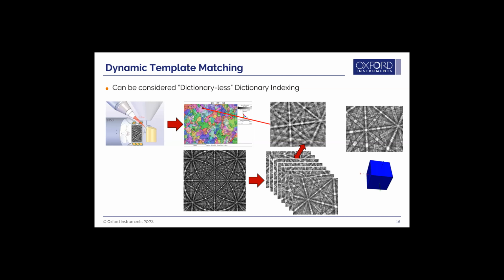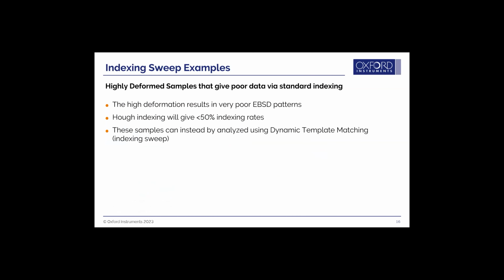So you can imagine that if you're generating this many patterns, it could take some time to actually focus in on a solution here. The good news is it actually will come up with a solution every time. The bad news is it will come up with a solution every single time. And so I'll give you an example first, and then we'll go through the correlation factor that really helps us determine if we did a good job or not.